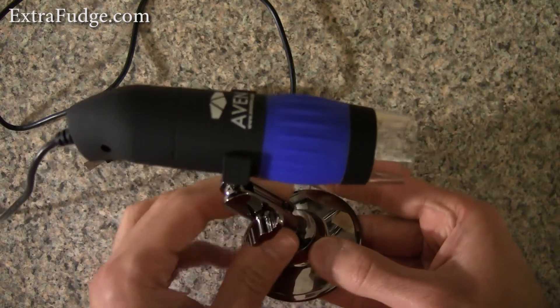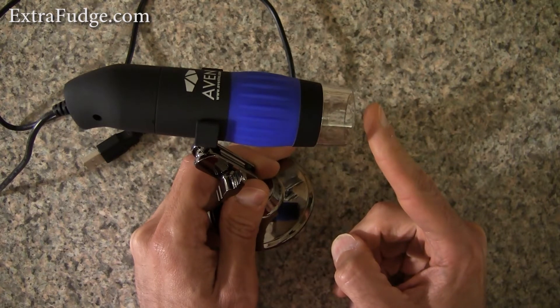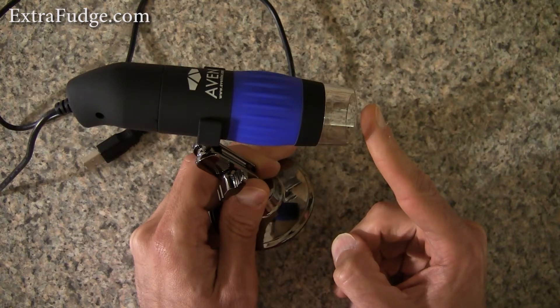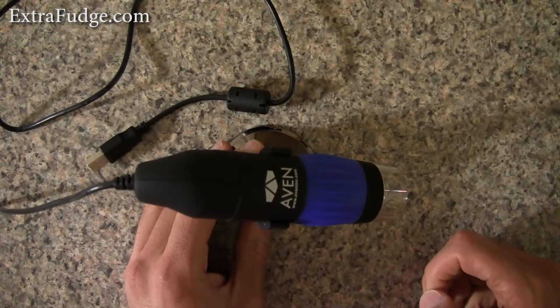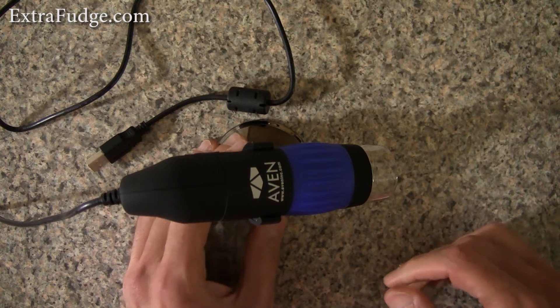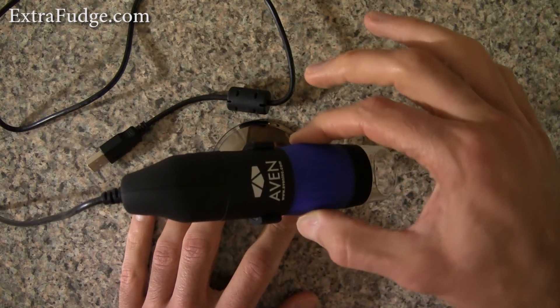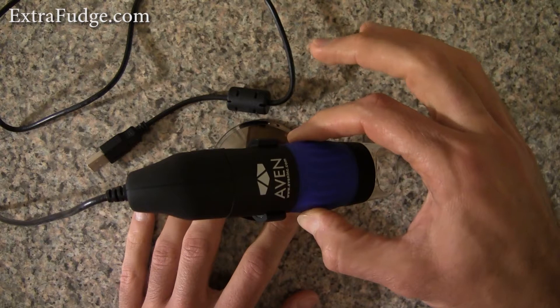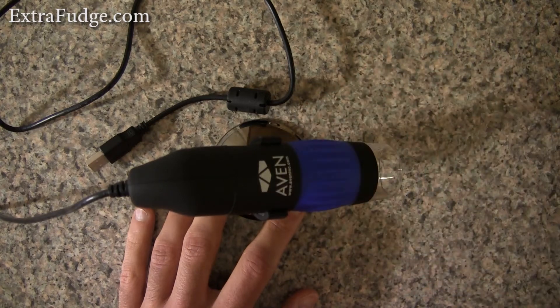That was quite the letdown, because there are a lot of situations where you want something stationary and just want to change the magnification without moving the object. Another thing I didn't like was the focus ring — I would have preferred if this was done via software, motorized, or at least easier to rotate, because it's quite hard to rotate and when you do, the entire thing moves.